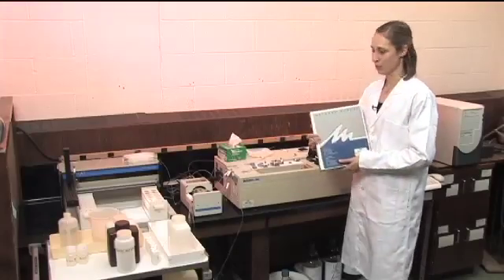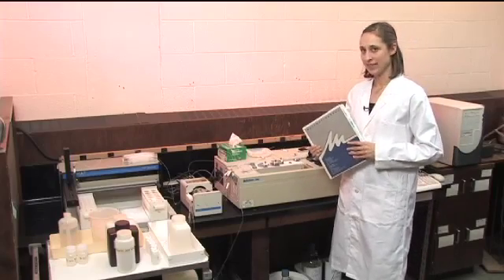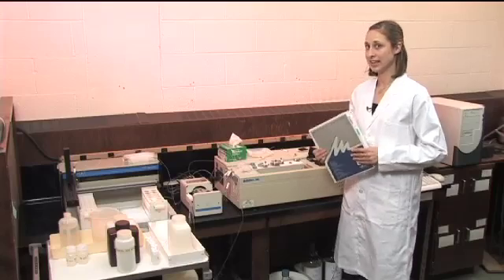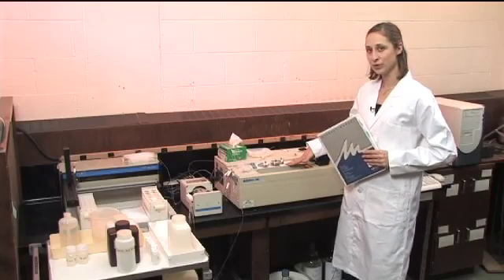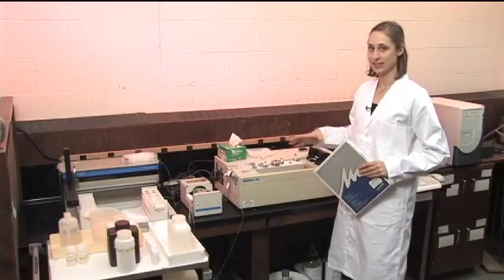Each thing that you want to analyze for has a specific method, and you can look up the method and it gives you all the reagents, it gives you a specific manifold for mixing the reagents, and everything you need to know about how to set the instrument up.